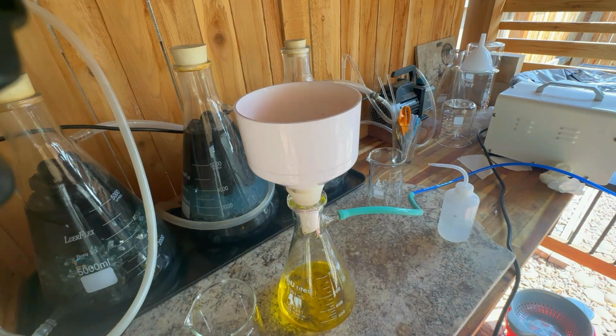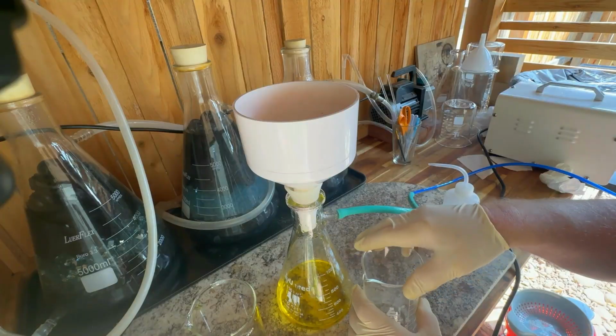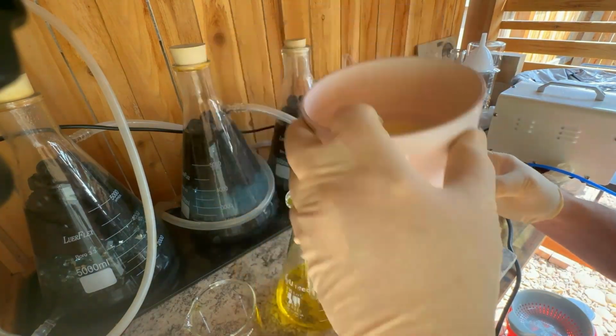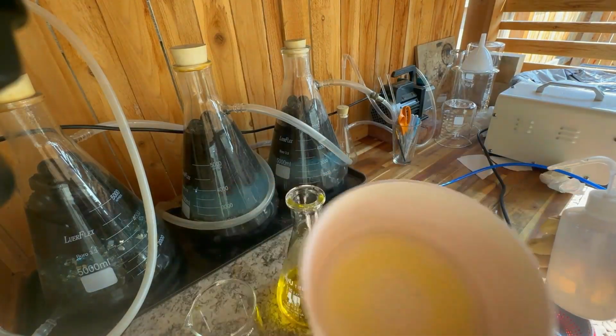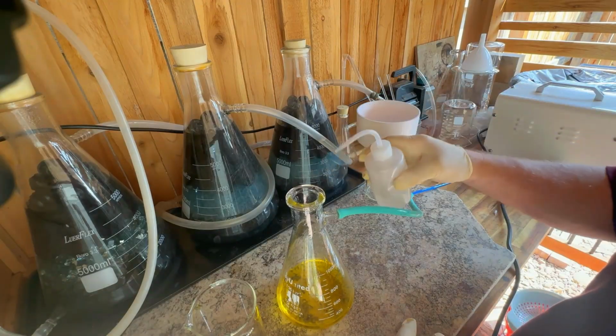Okay, second filtration's done. It's looking pretty good. Get it cleaned up here. There's a little bit of solution still in that paper. Put that in our paper storage, recover it when we process our papers.